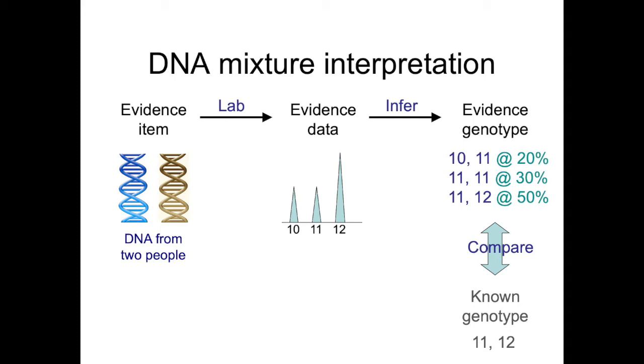You only have 2 parents. You're not supposed to have more than 2 alleles for a person. So if you're seeing this at locus after locus on different chromosomes, this is a mixture. There's more than one person in here because there's more than 2 alleles in the data. And they've added their alleles together to give you whatever the pattern is. And so the task is to separate out the genotypes of each of the contributors.